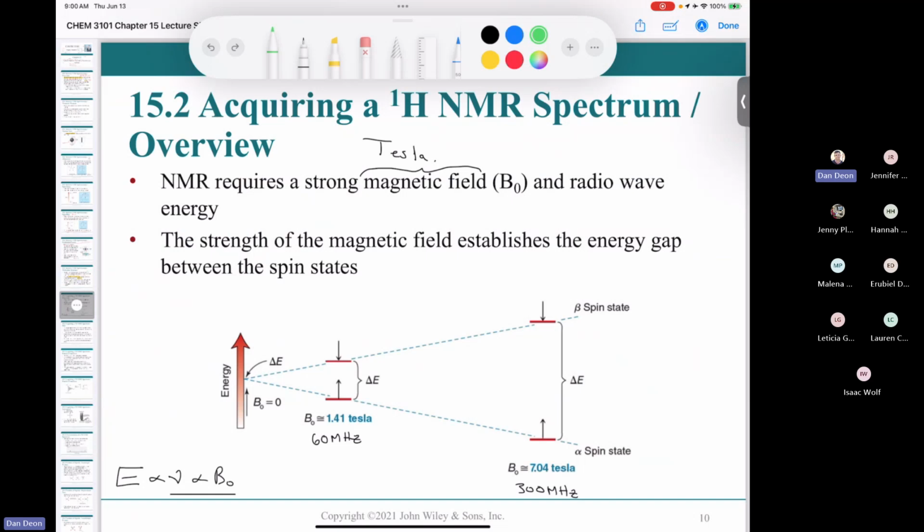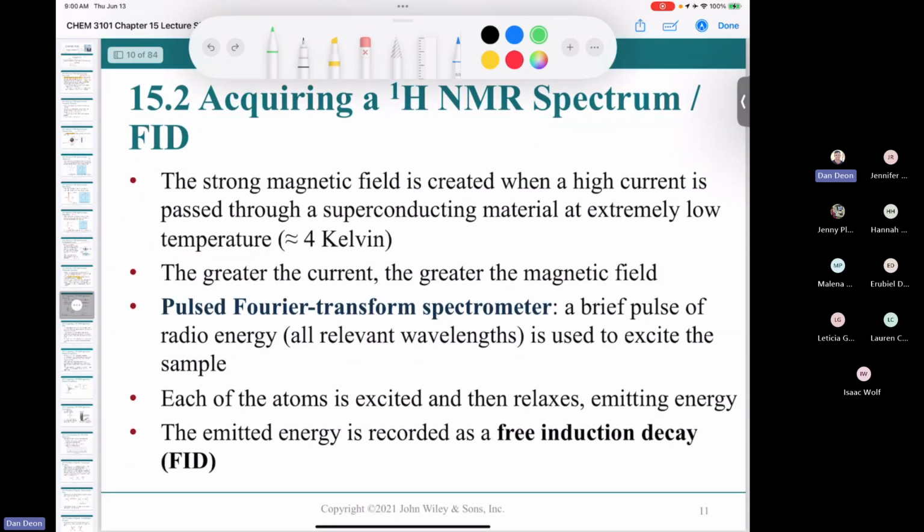Yes. Okay, you get the same story both ways, but you get a lot more detail with the more expensive TV, don't you? And that's kind of the way it is with the more expensive spectrometer. You get the same information, you can run the same spectrum, but you get more detail, and that detail can be really important sometimes when you have protons that resonate close together. Anyhow, you'll see that more later on.